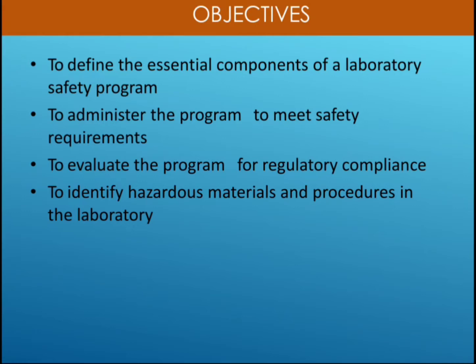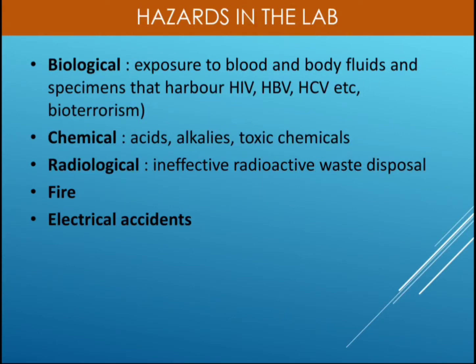That is the third objective of laboratory safety, why it is to be implemented. Next is to identify the hazardous materials and procedures in the laboratory. We have to identify the hazardous materials which are present in the laboratory and the procedures which are hazardous in the quality control laboratory.